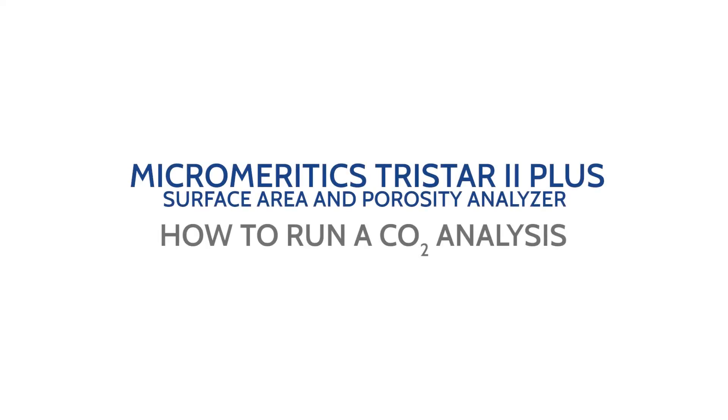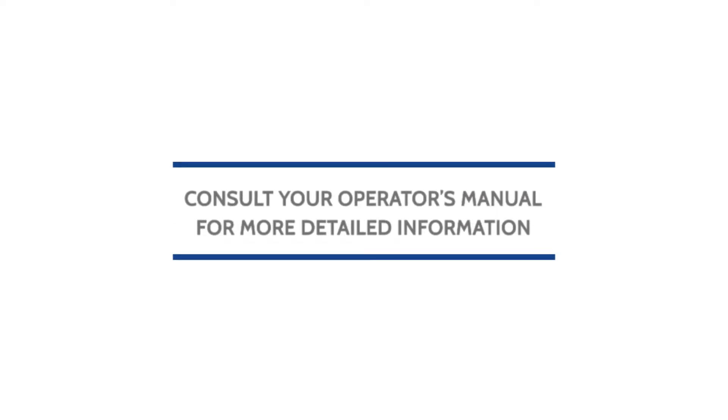This video will show you how to run a CO2 analysis on the Micromeridics Tristar 2 Plus Surface Area and Porosity Analyzer. Remember to always consult your operator's manual for more detailed information.